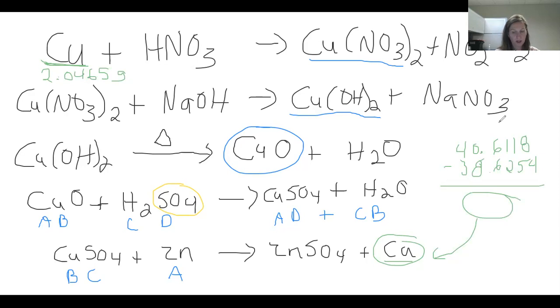And I'm going to show you the equations to solve for percent recovery and percent error. I have those on a different screen here, so let me show you those equations. There you go.